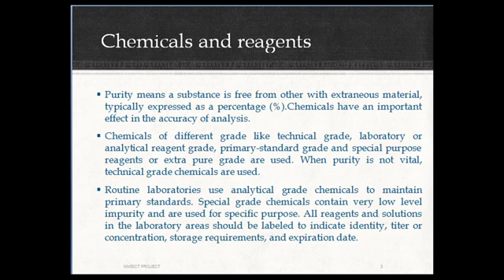Purity means a substance is free from other extraneous material, typically expressed as a percentage. Chemicals have an important effect on the accuracy of analysis. Chemicals of different grades, like technical grade, laboratory or analytical reagent grade, primary standard grade, and special purpose reagent or extra pure grade, are used.